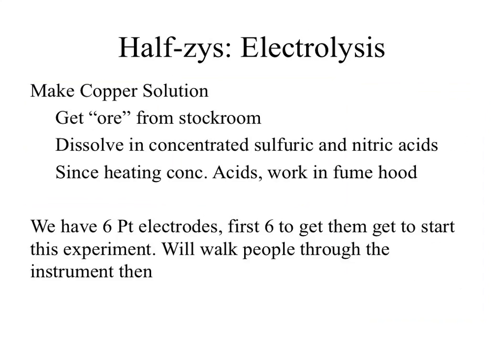The other thing that they're helpful for is that they will react with copper metal and turn it into copper ion. Okay? So that's going to take our entire ore sample and hopefully convert it directly across into a complete and even solution. So we don't have to worry about particles floating in it or anything like that. Okay? To speed this process along, because it is a redox reaction, we want to help facilitate that, and to do that, what we'll do is heat the reaction up, okay?